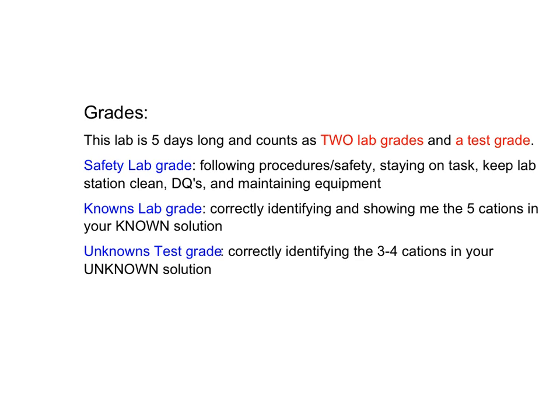The second time, we will give you your unknown solution. You will run through the entire lab. You do not have to come show us when you generate one of your solids to indicate the presence of an ion. Instead, you're going to run through the entire lab, all on your own, all the way from the start to the end. And at the very, very end, you will come to your teacher and say, after our testing, we have determined that in our unknown solution, we had blank, blank, blank, and potentially blank. Right? You're going to say what your 3 or 4 ions were in your unknown.